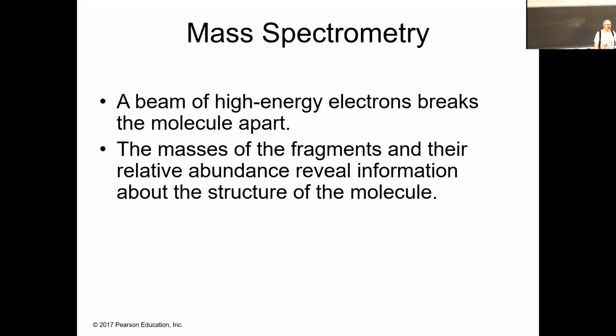Mass spectrometry uses a beam of high energy electrons to break a molecule apart. Right, this is like shooting clay pigeons or clay targets. The electrons strike the molecule and cause it to fragment.